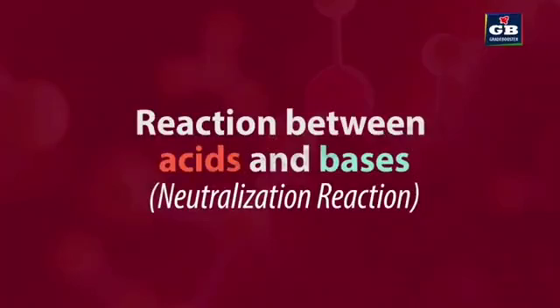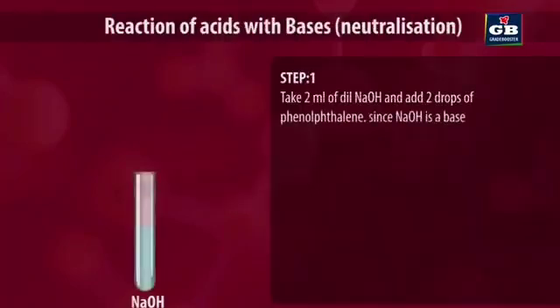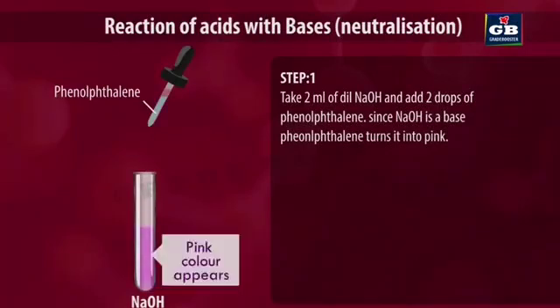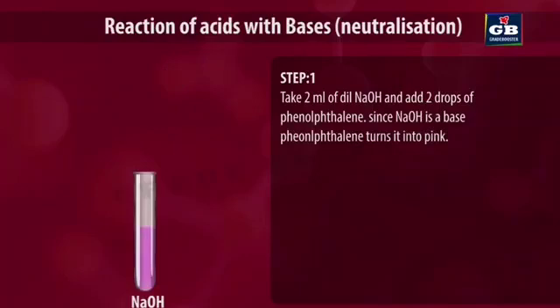Reaction between acids and bases. Let us see an activity to understand this. Take 2 ml of dilute sodium hydroxide and add 2 drops of phenolphthalein. Since sodium hydroxide is a base, phenolphthalein turns it pink.